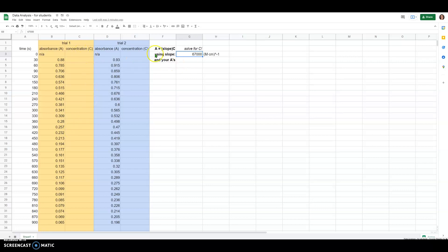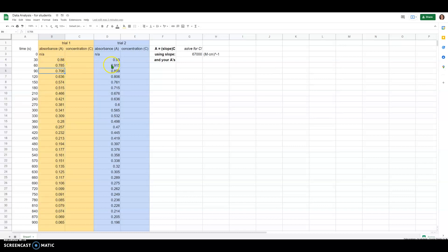What I have set up here is a Google Sheets file that already has my time in seconds in the first column. I've highlighted trial one and trial two's data with some colors. The first column for each shows the absorbance values and the second column shows where we're going to be calculating the concentrations.